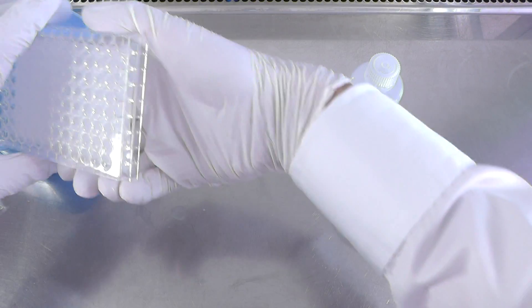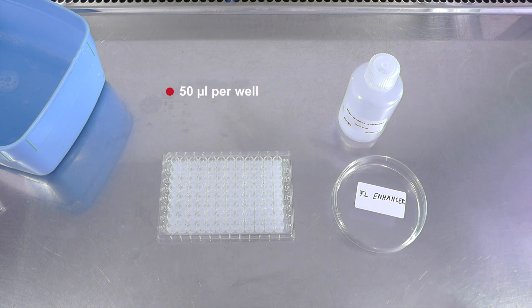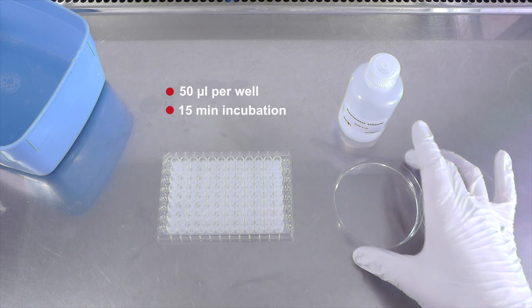Here you can see the technician emptying the last round of PBS wash right before the enhancer is added. 50 microliters per well is incubated at room temperature for 15 minutes.